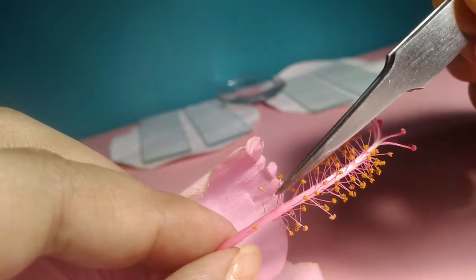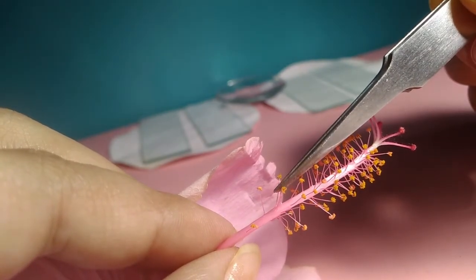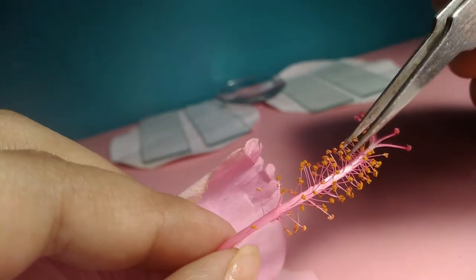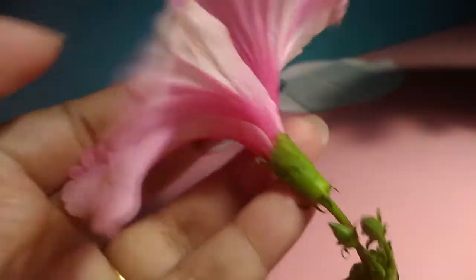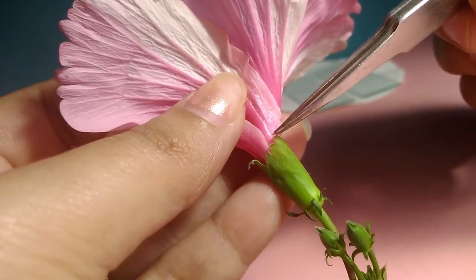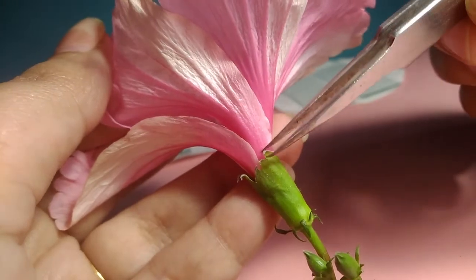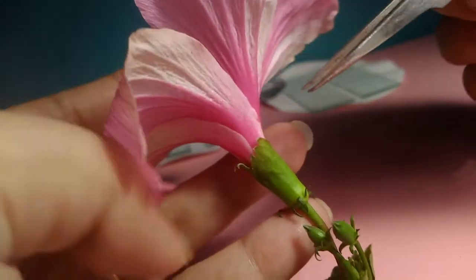And this entire thing, the anther plus the filament, they constitute the stamen of the flower. Okay, so far we have studied 4 structures. 1, the outermost whorl of the flower, the outermost structure of the flower, which is the calyx, and each unit of calyx is known as sepals.